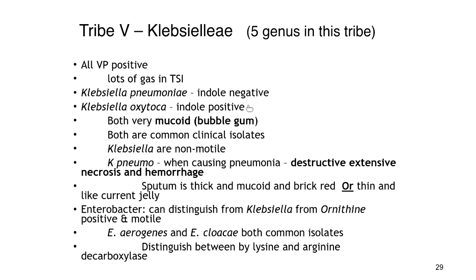Again, I'm not going to have you spit that back on a test, but this information is here to broaden your knowledge and your understanding. Both of these are what we call mucoid, bubblegum looking. So when you waft across your plate and you're doing an odor test, wafting, W-A-F-T-I-N-G, the colonies smell a little bit bubblegumish, and they look pinkish, mucoid, like a piece of gum stuck on it. Okay, so they're very mucoid, bubblegum color, Klebsiella.